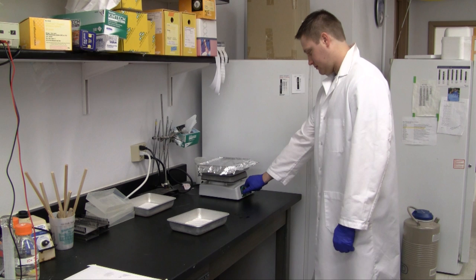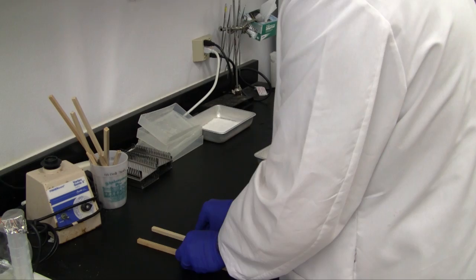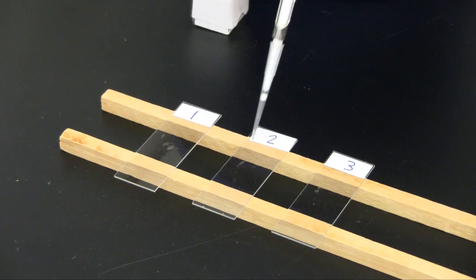Prepared probes must be hybridized to slides before they can be visualized. To begin, a water bath is preheated until near boiling. Slides to be hybridized are laid out on an elevated surface, such as the two sticks shown. Once the water is boiling, 8 microliters of fluorescent probe is pipetted onto each slide and covered with a plastic cover slip.